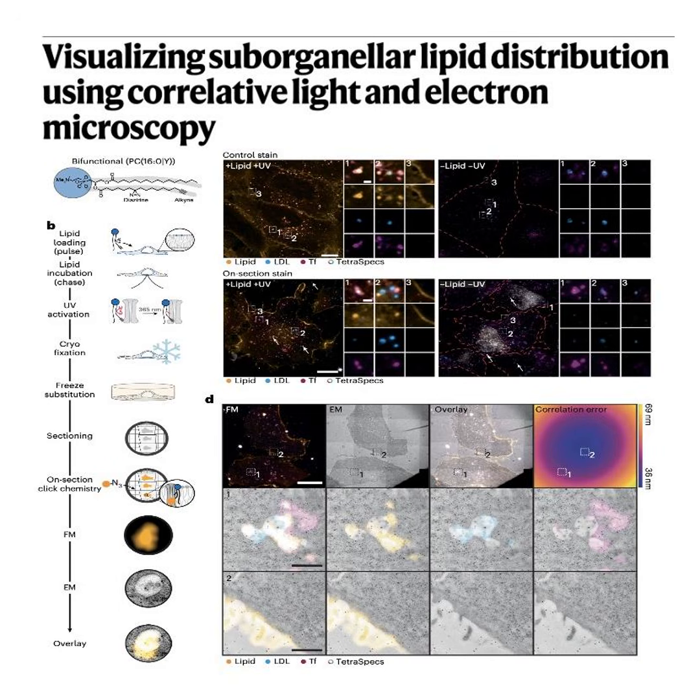And what about the main sorting floor? The boundary membrane, or BM, was slightly depleted at 0.88 times density. A density of 3.64 in the destruction route isn't just passive drifting. That is active hoarding. The cell is deliberately shoving sphingomyelin into the ILVs. But wait, does it do this for all fats? That is the exact question of specificity they had to answer next.